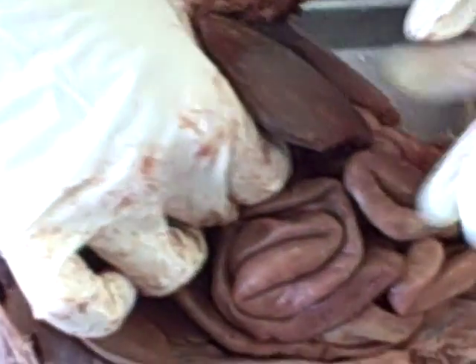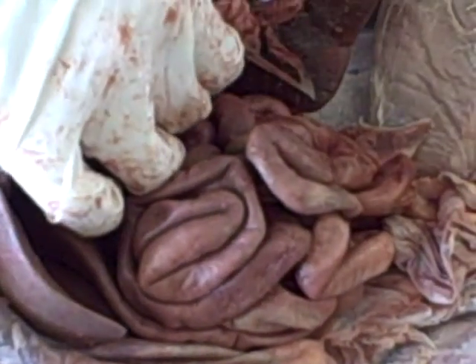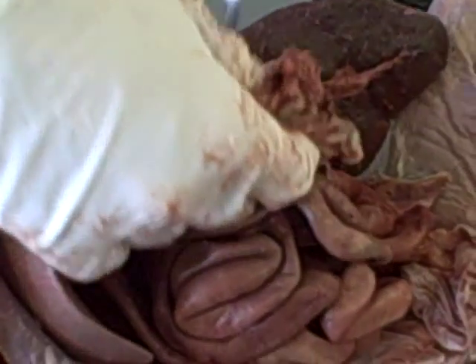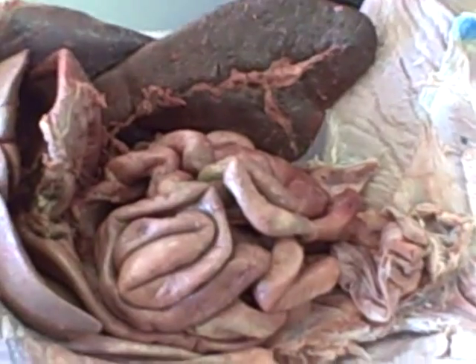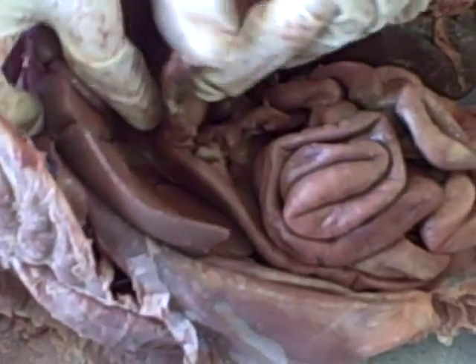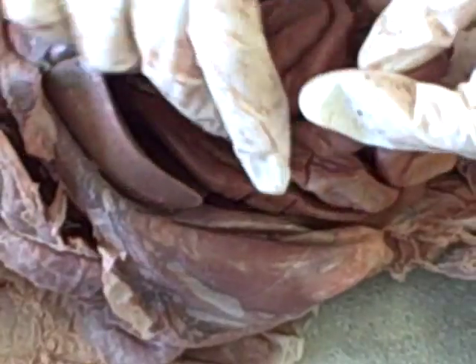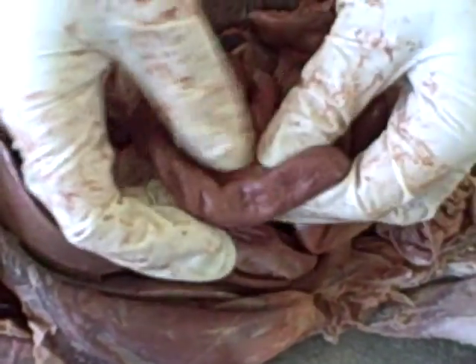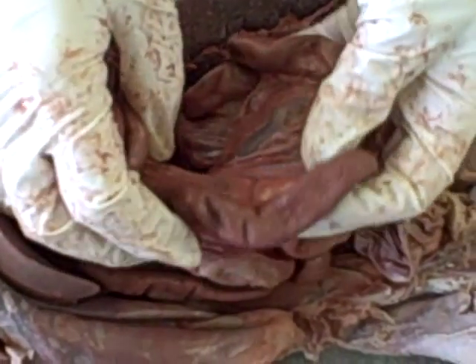Notice it's attached to this deep dark red fleshy organ as well. Remove all that. Okay, so that's the mesentery. Leading from this large J-shaped organ, it goes into a small tubed organ that invaginates and rolls back and forth and back and forth. So the next question I would ask is, what is this long, small tube organ, the whole thing?